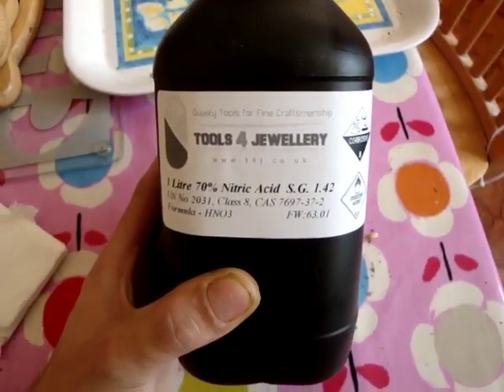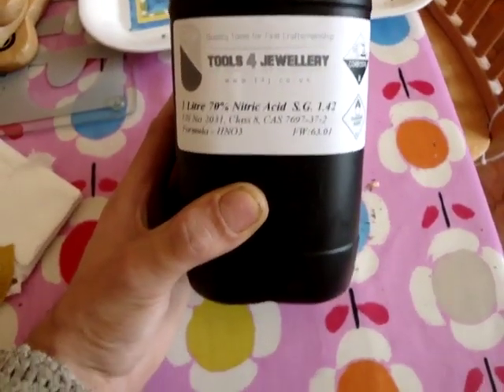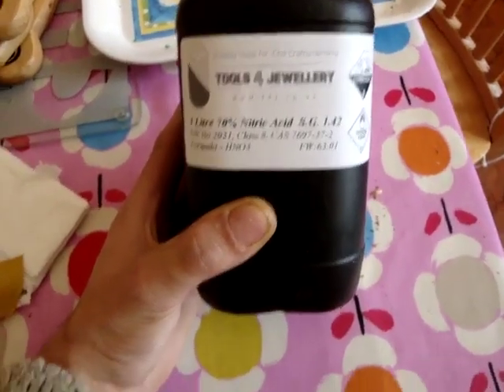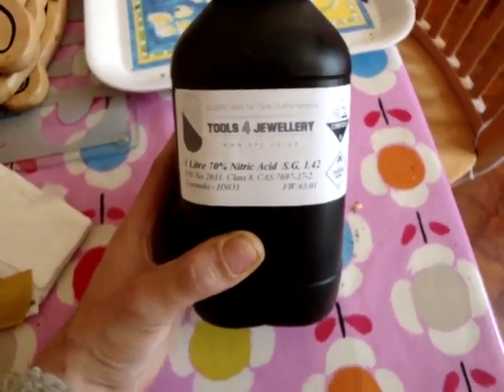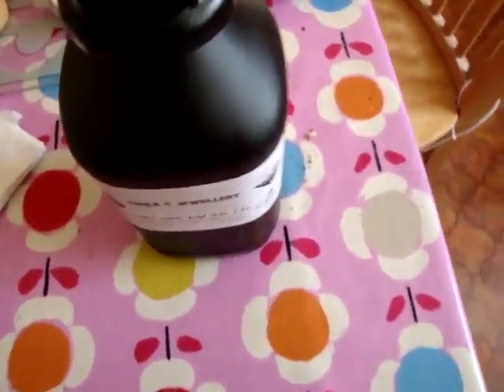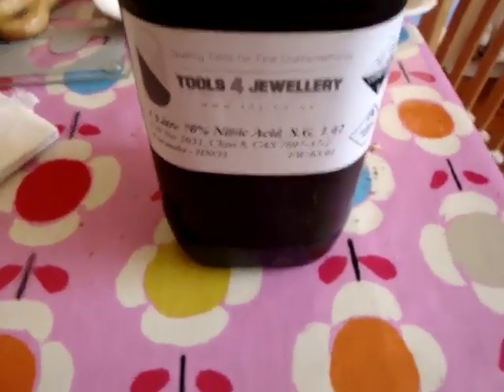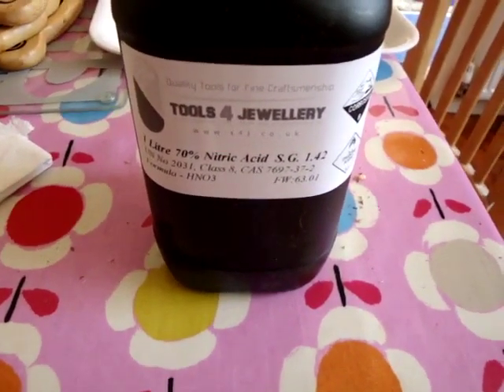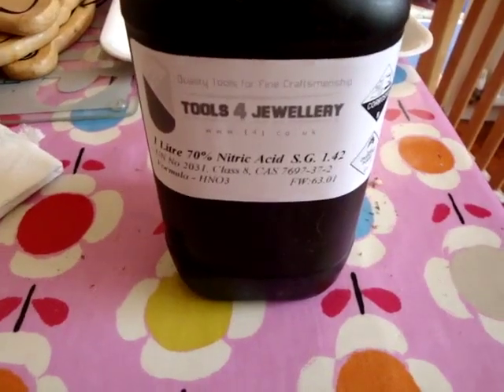We're going to do this, and like I say, be careful with this nitric acid. It's not fuming nitric acid - I think you have to have like 80 or 90% for that - but this is the strongest you can get, and it came from eBay. It wasn't cheap, that's for sure. So we're going to have to not use too much, and we might be able to reuse the acid anyway.